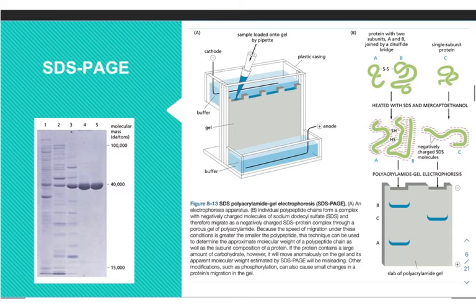So that's the thing with proteins in SDS-PAGE, which PAGE, by the way, stands for polyacrylamide gel electrophoresis, polyacrylamide being the gel material. We'll talk about the SDS in a minute. But in this electrophoresis, we've got proteins of varying sizes trying to get through the pores in this gel. So this electrophoresis will separate things out by size, because smaller things can get through more pores, and basically get farther down the gel in a given amount of time.